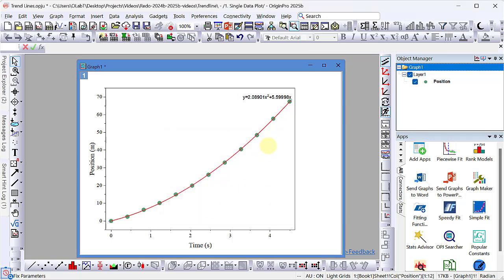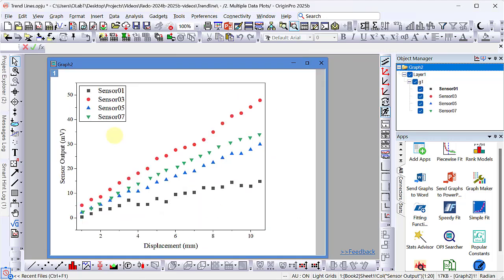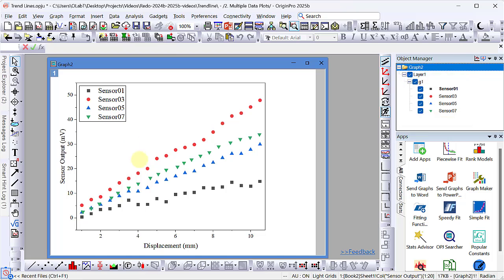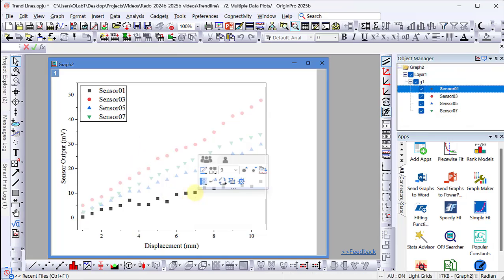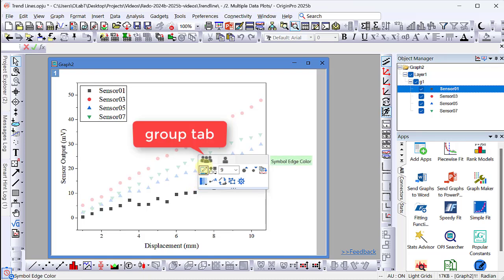Now let's look at an example with multiple data plots in a graph. Here we have four data plots from four different sensors. From the object manager panel, you can see that this is a grouped plot. If I now click on a data plot, the mini toolbar opens with the group tab active.